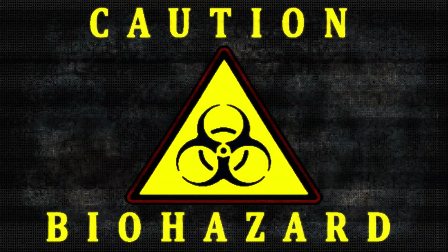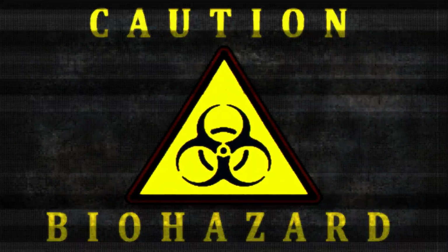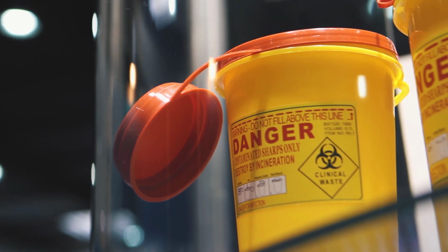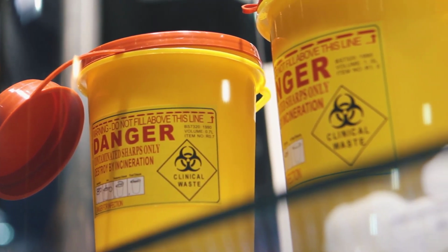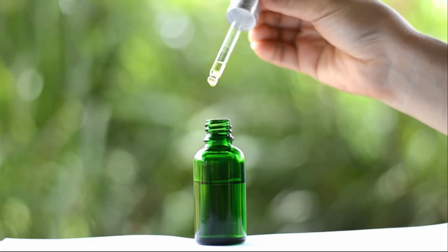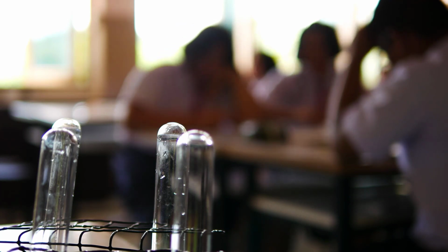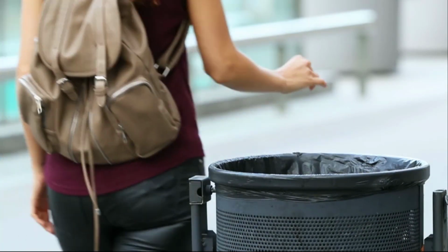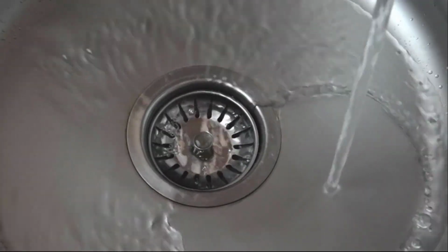Discard all cultures and used glassware into a container labeled contaminated. This container will later be sterilized. Plastic or other disposable items should be discarded separately from glassware in containers to be sterilized. Never place contaminated pipettes on the benchtop. Never discard contaminated cultures, glassware, pipettes, tubes, or slides in the waste paper basket or garbage can. Never discard contaminated liquids or liquid cultures in the sink.